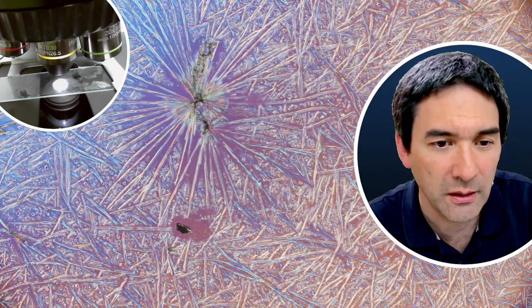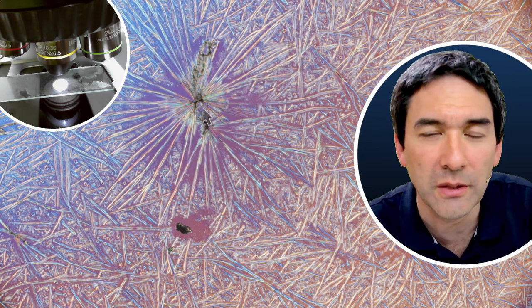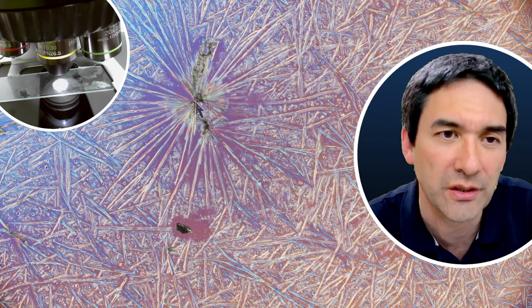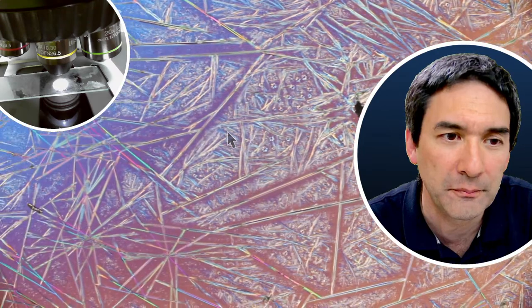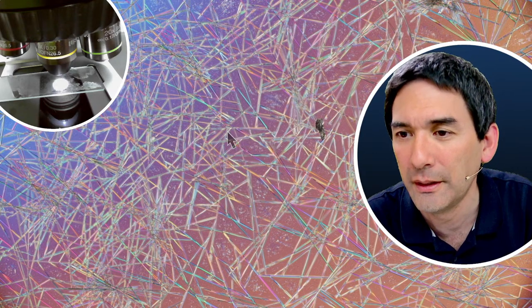But for example, here you see it quite nicely. Let's turn on the arrow again. Usually here in the center, if there's some kind of an impurity, a little bit of dust or dirt, this is where crystallization starts, and then it starts to radiate outwards. Sometimes these impurities or crystallization seeds are quite relevant for crystallization even to start. So this is basically how it looks under the compound microscope.